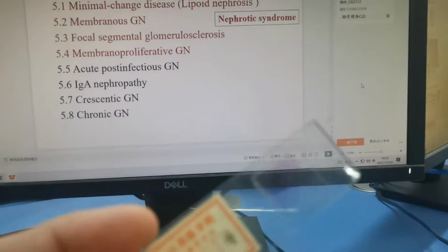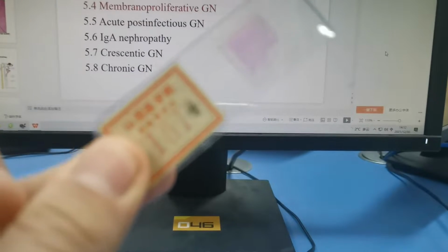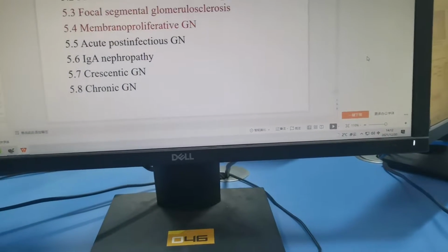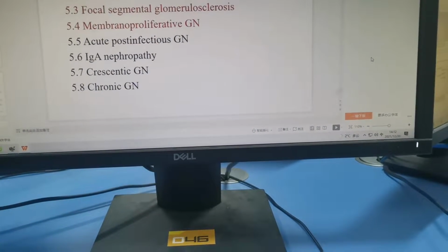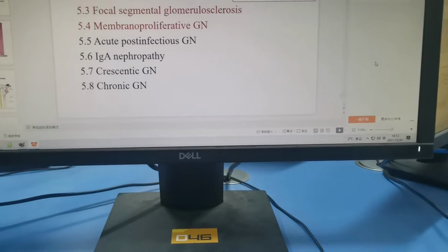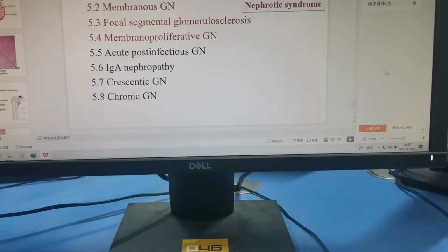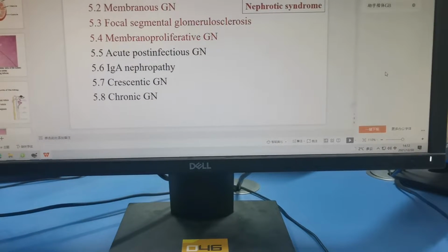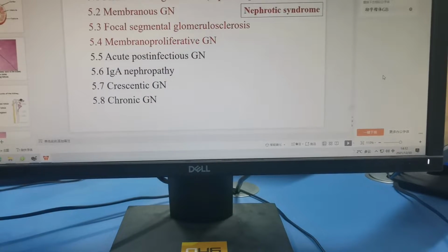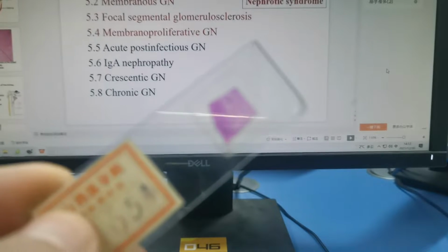So we got two slides from Dr. Wesley. These are the slides. We are going to put them inside the microscope and we'll show you other slides too. Guys, we are in China, studying MBBS, so I'm showing how we study during this lockdown. Most of the migrations are closed for international students, but we are still taking classes inside universities in China.